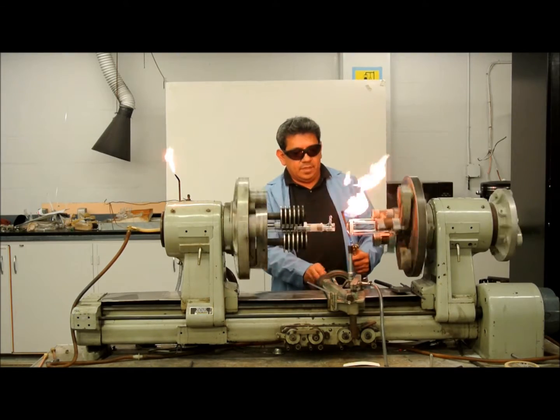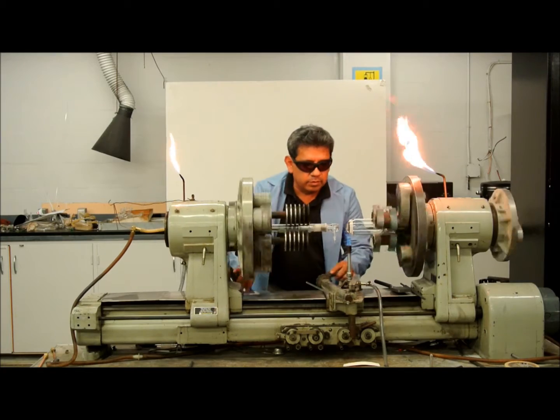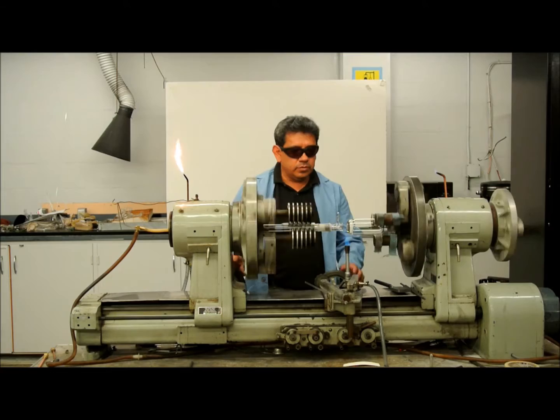So now what I'm going to do is warm up the adapter, or the piece that broke, which will take another five minutes maybe, and then we'll go ahead and make the seal.